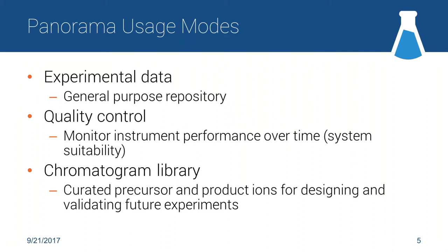The chromatogram library folder — which we won't go into much detail on today due to time constraints — allows us to create a curated set of chromatograms, identify the best representative expression of each, download that, and use it to inform future experiments looking for the same peptide, scoring that future observation against the known library chromatogram.